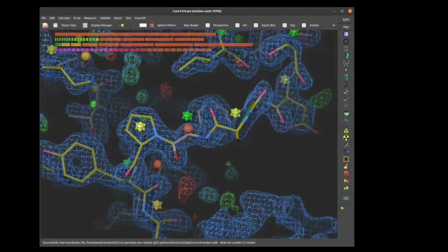What's new is that at the top there, in the top left-hand side, you can see these multicolored bars, because what we want to do is reduce the color of those bars to make them more green-like and smaller. So they're illness bars really, I suppose.